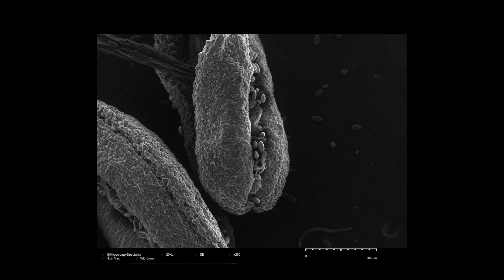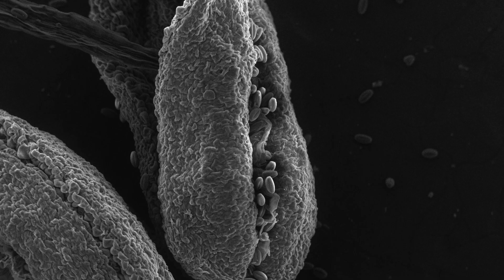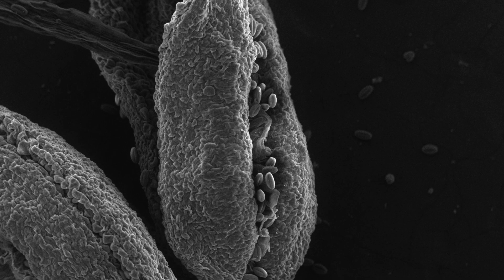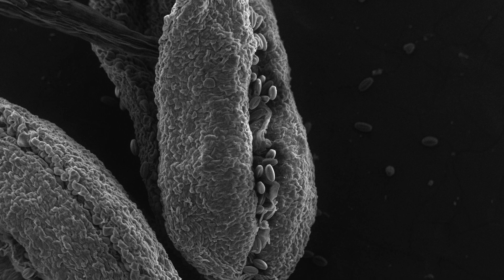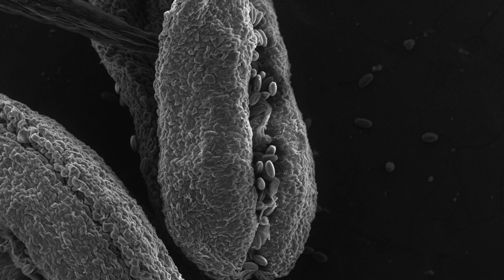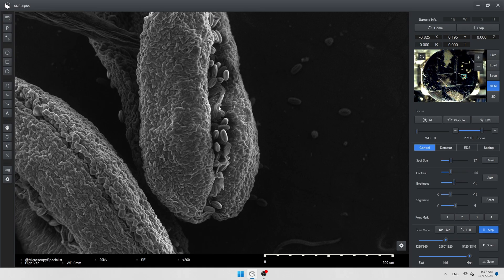Our first scan. As you can see, we can clearly see all the field of our specimen, everything is sharp and clear. Depth of field is huge and we can clearly see something like 3D image.